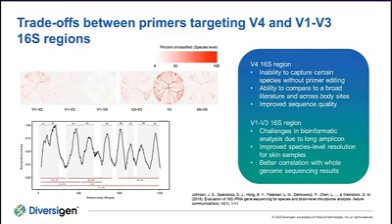Amplification of the V1 to V3 regions of the 16S gene is, as I mentioned, the current gold standard in skin microbiome analysis. Even though there are some bioinformatic challenges associated with the longer amplicon length, which is about 500 base pairs, compared to the V4 region, which is about 290 base pairs, amplification of the V1 to V3 region does improve taxonomic classification, especially at the species level. Also, results are usually better correlated with shotgun sequencing results. For all these reasons, most of the discussion in today's webinar will be based on the V1 to V3 regions of the 16S gene.